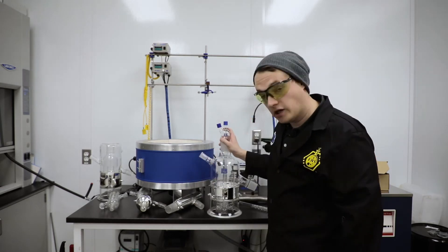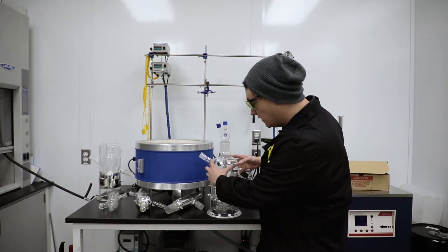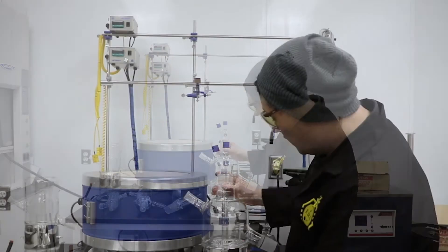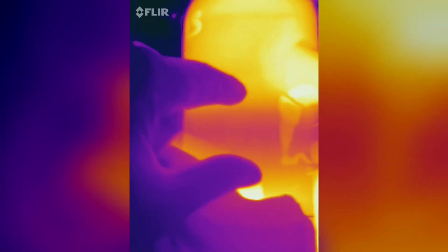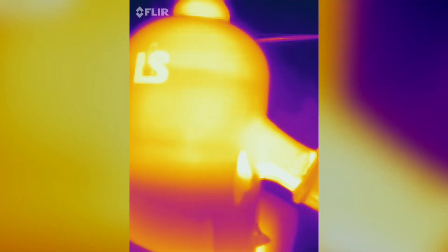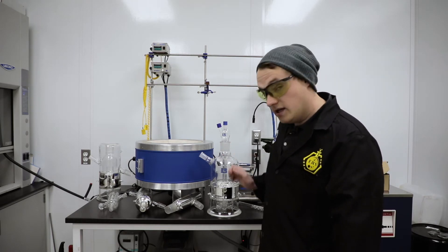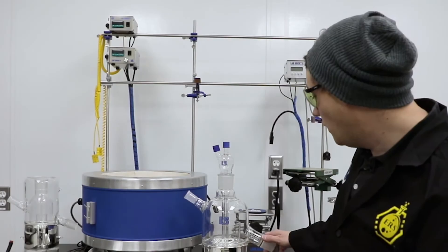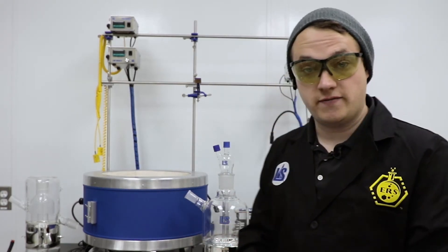What's great about this is you can control the reflux ratio by choosing different temperatures, but you're still going to gain the effect of having this very large external pre-condenser. This head has a much larger temperature differential between the silvered vacuum-jacketed portion and the non-vacuum-jacketed portion, and that temperature differential triggers very rapid condensation. Another cool thing about this head is that it goes on either a 20 or a 50 liter flask. We'll be showing some videos of this running this week — potentially using our infrared camera so we can actually show you the difference between the sections of the head and how that plays a role in the speed of the distillation.